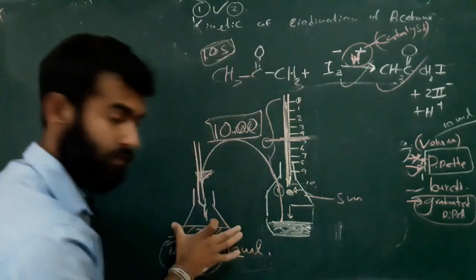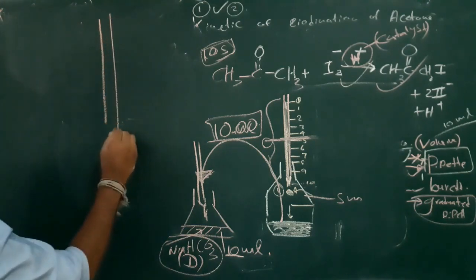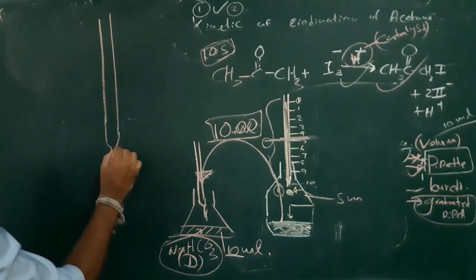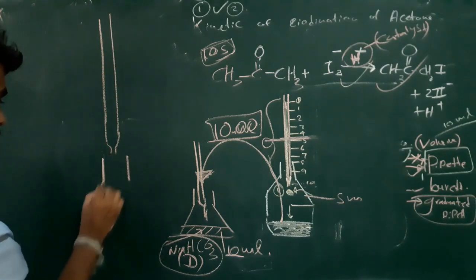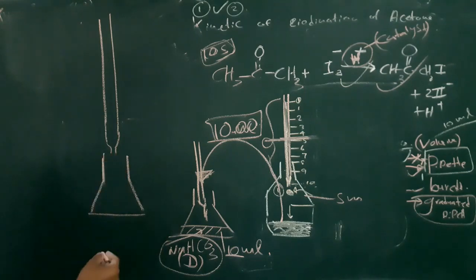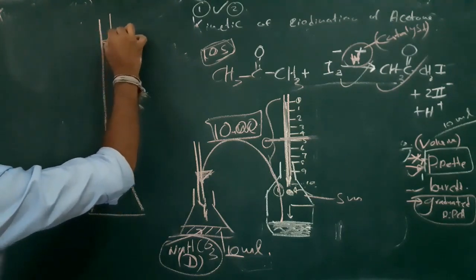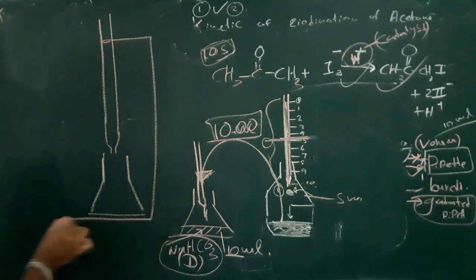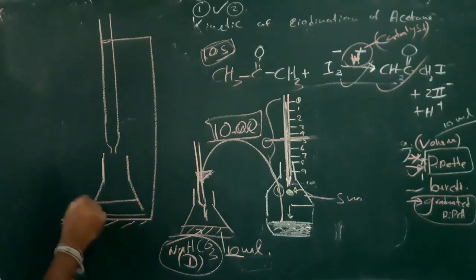Now the reaction is stopped. Now we will titrate this solution. Here is your reaction mixture.